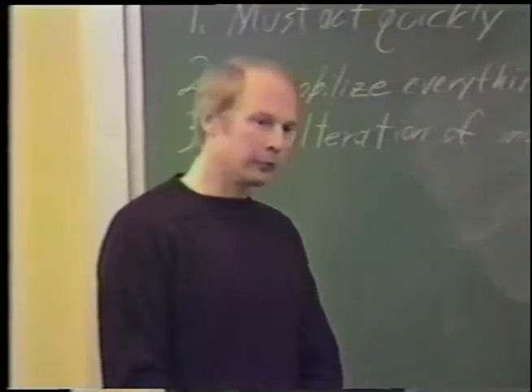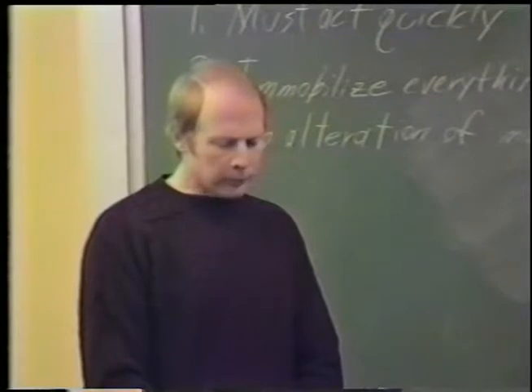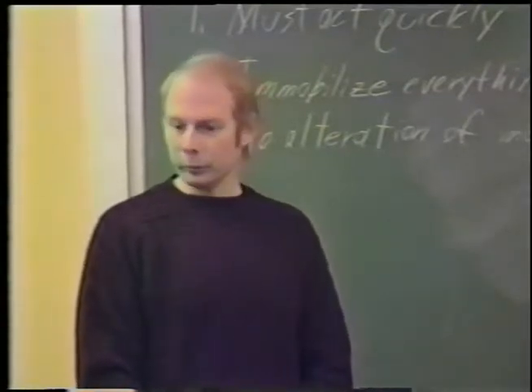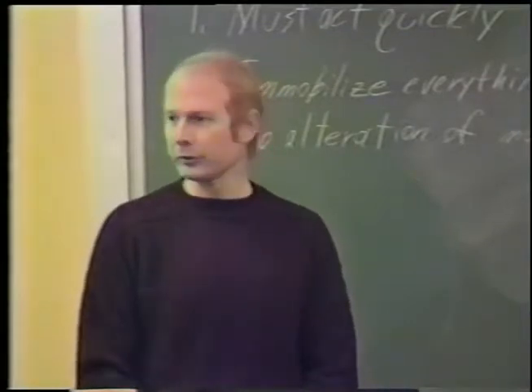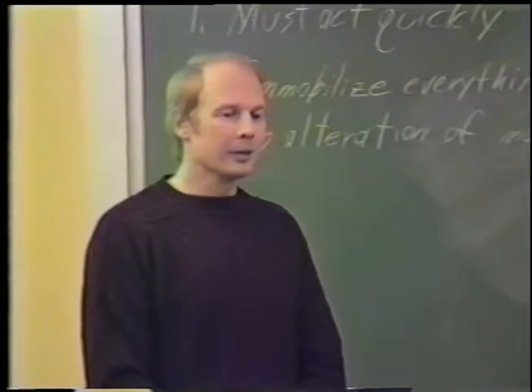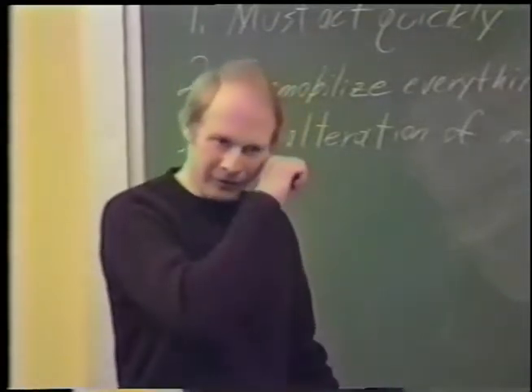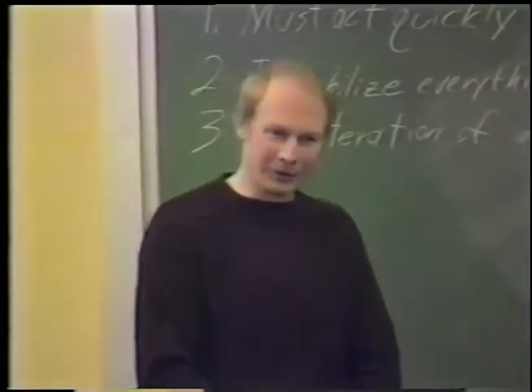You can't get away with the depths as great as we were just talking about. And some plant cells contain natural cryoprotectants, so they're nice to work with in that way. You can get really nice freezing again to considerable depths, even greater than in marine organisms, if you're very fortunate to be working with such a system. There's one organism, Dunaliella salina, that I know of, there are probably others, that in fact fills itself full of glycerol to a very high concentration. In fact, I used that as a test object a few years ago in some freeze-substitution studies because I knew I could freeze it well all the time.